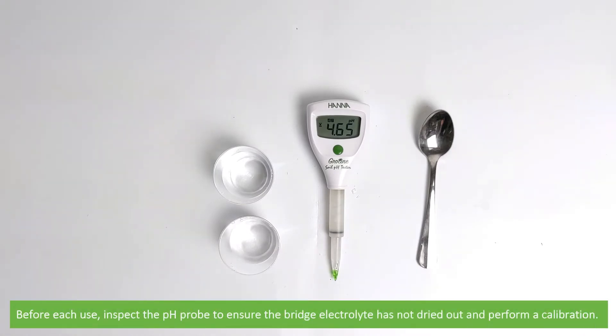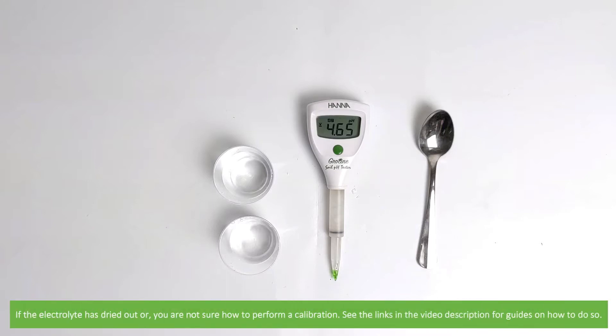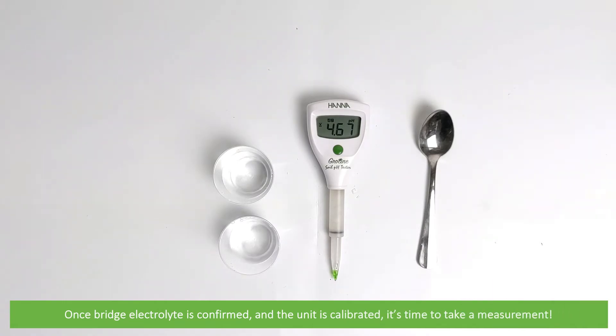Before each use, inspect the pH probe to ensure the bridge electrolyte has not dried out and perform a calibration. If the electrolyte has dried out or you're not sure how to perform a calibration, see the links in the video description for guides on how to do so. Once the bridge electrolyte is confirmed and the unit is calibrated, it's time to take a measurement.